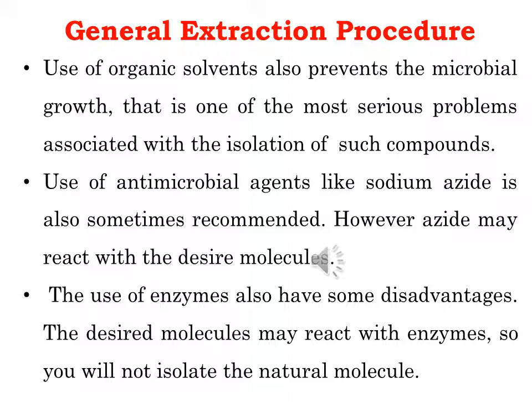In the normal extraction process, it is difficult to isolate the native glycosides because the terminal glucose unit is lost by the action of indigenous beta-glucosidase, and only digitoxin and gitoxin can be isolated. Deactivation and denaturation of the enzyme can be carried out by quick heating or treatment with alcohol. But alcohol treatment does not necessarily deactivate the enzyme. Therefore, it is strongly recommended that the large molecular weight fractions containing liberated enzymes be removed as quickly as possible by methods such as ultrafiltration or gel filtration.